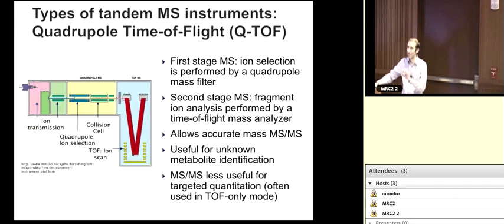It certainly helps with data consistency to batch all of your samples at once and run them on a single platform so that you can do the relevant comparisons. Where it gets tricky, and something that is really developing in the field, is where you need to submit samples multiple times over the course of years, and maybe compare data generated at multiple different sites. One option is to go to an extremely quantitative approach, with everything in terms of micromolar or nanomolar concentrations using a calibrated approach, and then things should be consistent from site to site regardless of the platform, if it's properly done. But in the case of untargeted profiling, that's much more difficult to do.